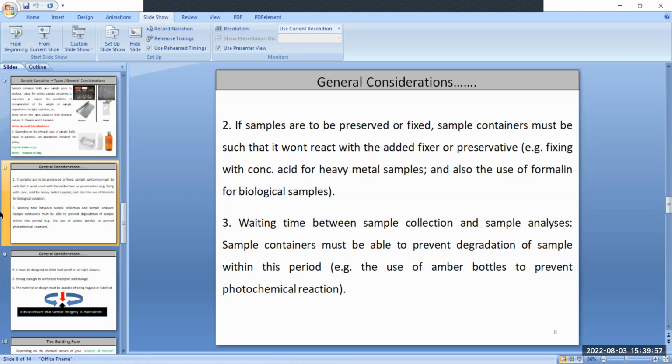They might interact in an irreversible way with your sample, but they must not interfere with the container holding the sample.